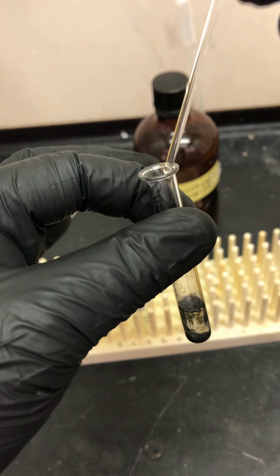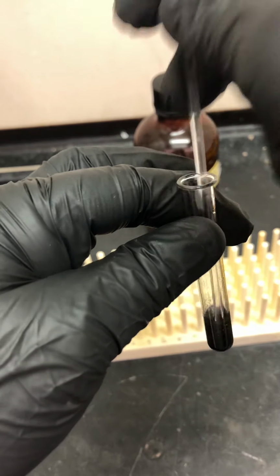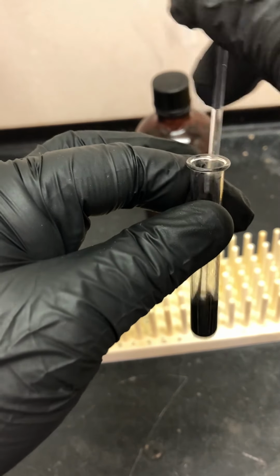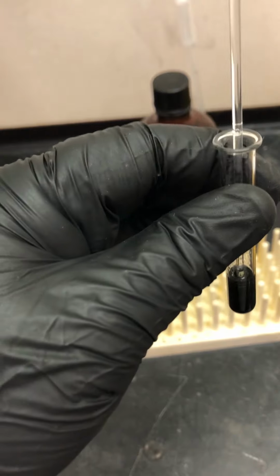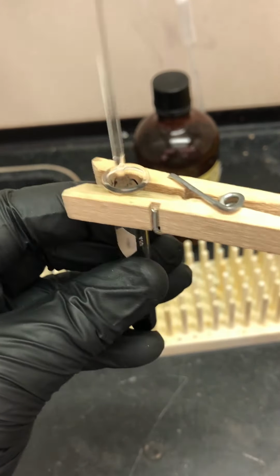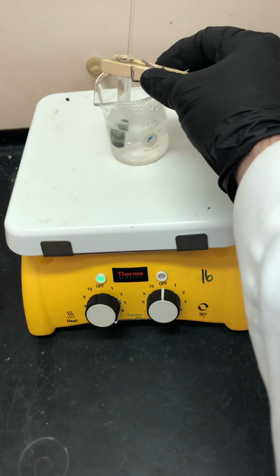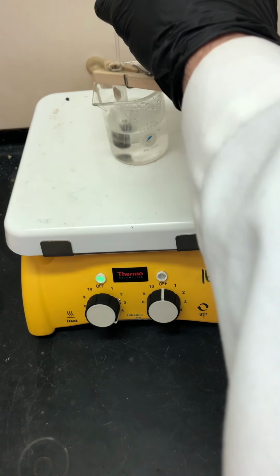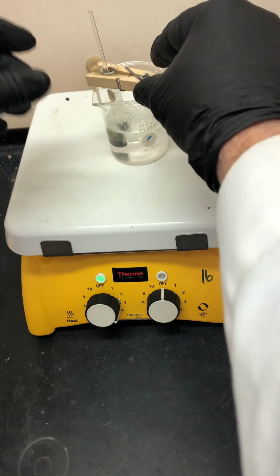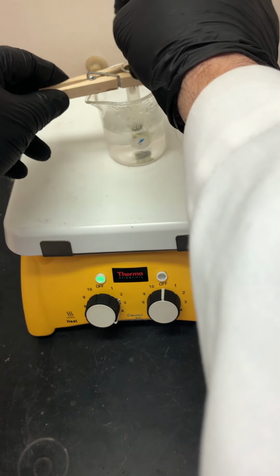So I'm going to bring a stir rod. I'm going to break it up and make sure I get the ones on the sides. And I'm going to bring again a clothespin, and I'm going to bring it into the boiling water bath again. So let me slide over here to the side. Here is my boiling water. I'm going to keep it in there and stir it. Let me hold it with this hand while I stir, turn it around a little bit while I stir it.